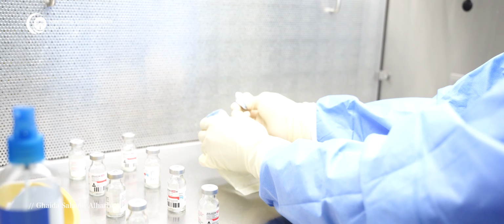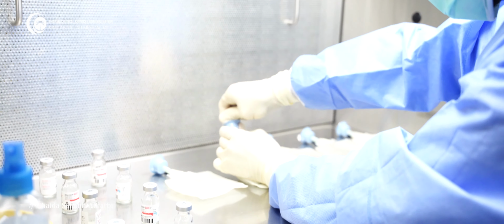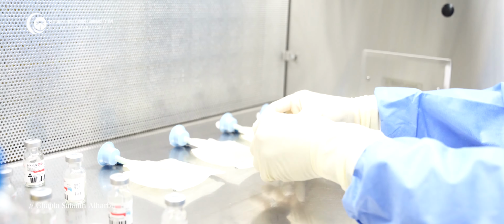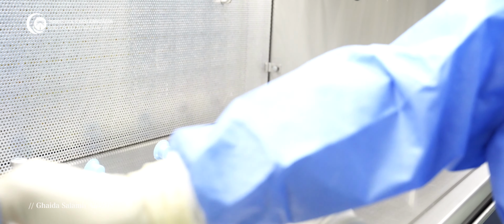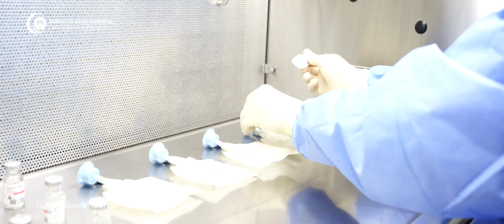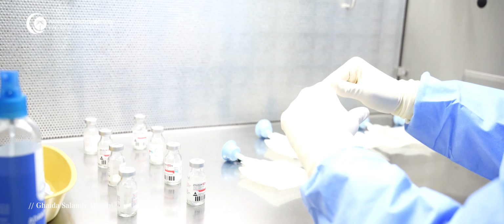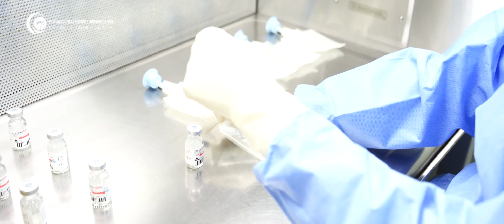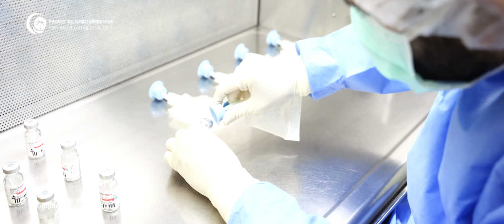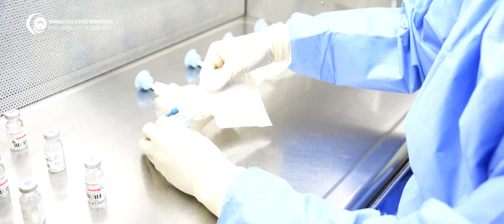Also take care that any item can make a zone of turbulence of the first air. That's why we will make a space between each object, like a vial and the other vial, with a space of about 3 volumes of the object. Then I will start the docking of the mini bag plus with the vials.